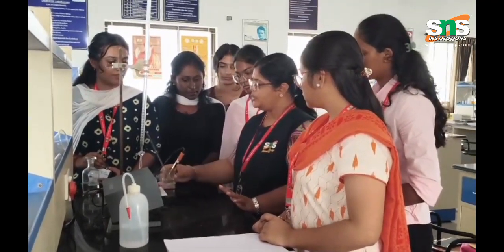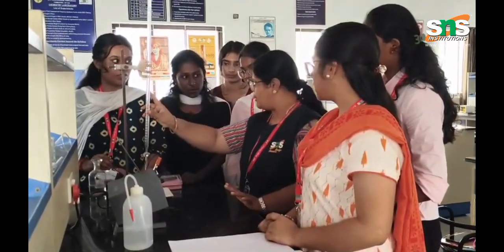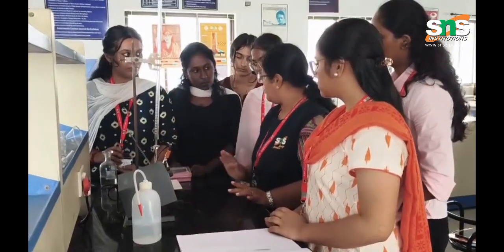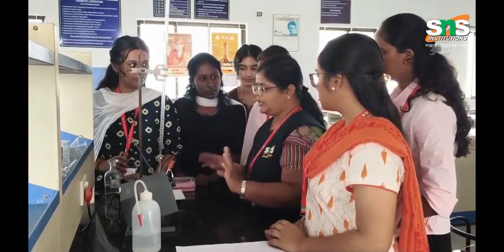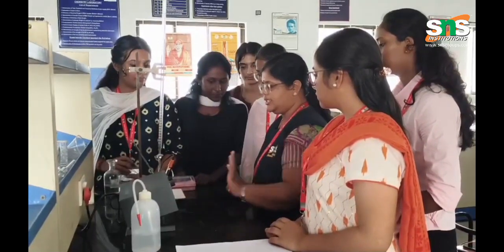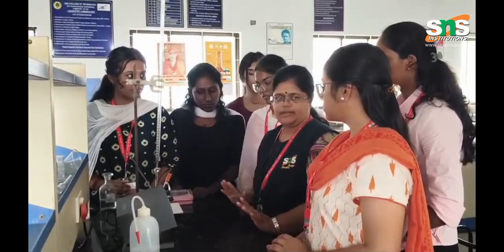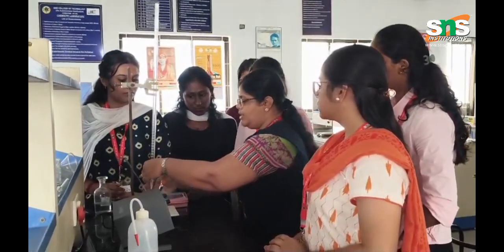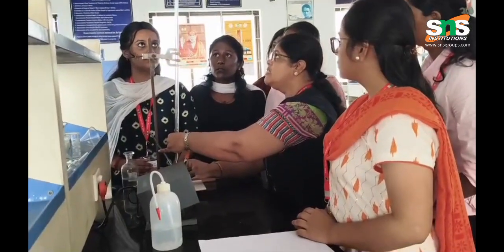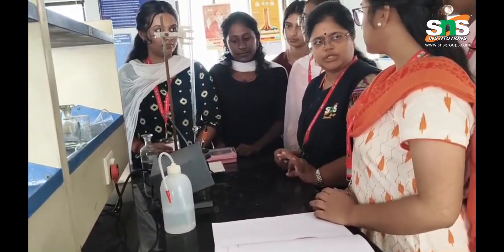This is sodium hydroxide, a strong base. Now we are going to titrate the acid mixture with this strong base. I have set the temperature, the conductance cell constant and the range; everything is set in this apparatus. Now we are going to titrate. I will add 1 ml of the base into the solution.